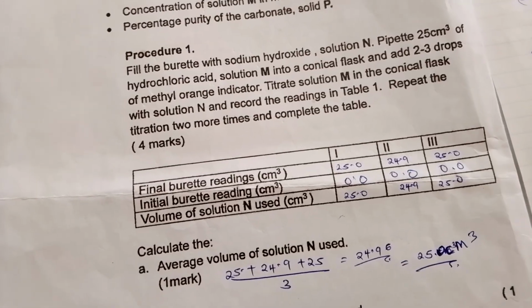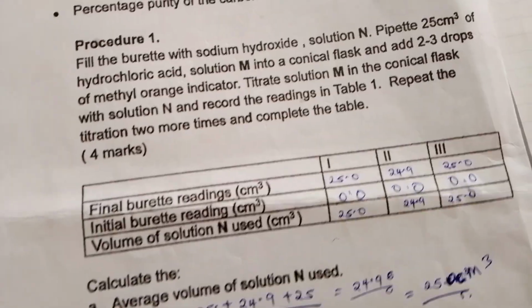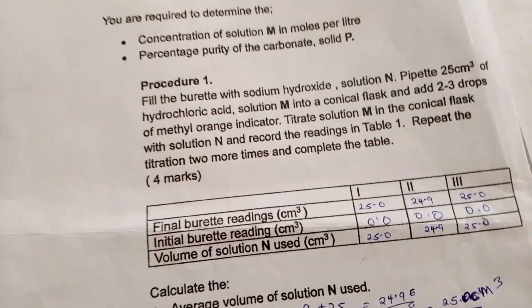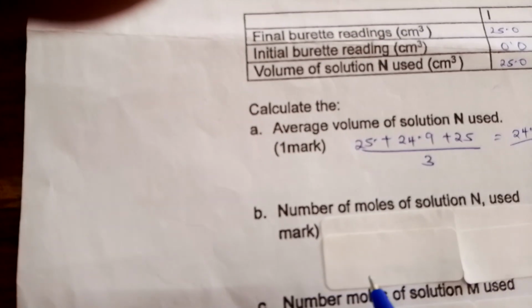And then we were instructed to calculate the number of moles of solution N used. If you have been told to calculate the number of moles, you will simply do like this.